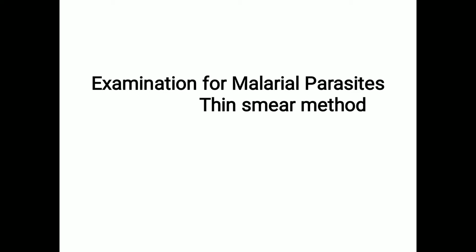The sample we prefer here is the blood sample. Next to feces, the largest numbers of parasites are found in blood. Blood examination is the routine diagnostic method in malaria, filariasis, and African trypanosomiasis. It is sometimes positive in Chagas disease and rarely in Kala Azar and toxoplasmosis.